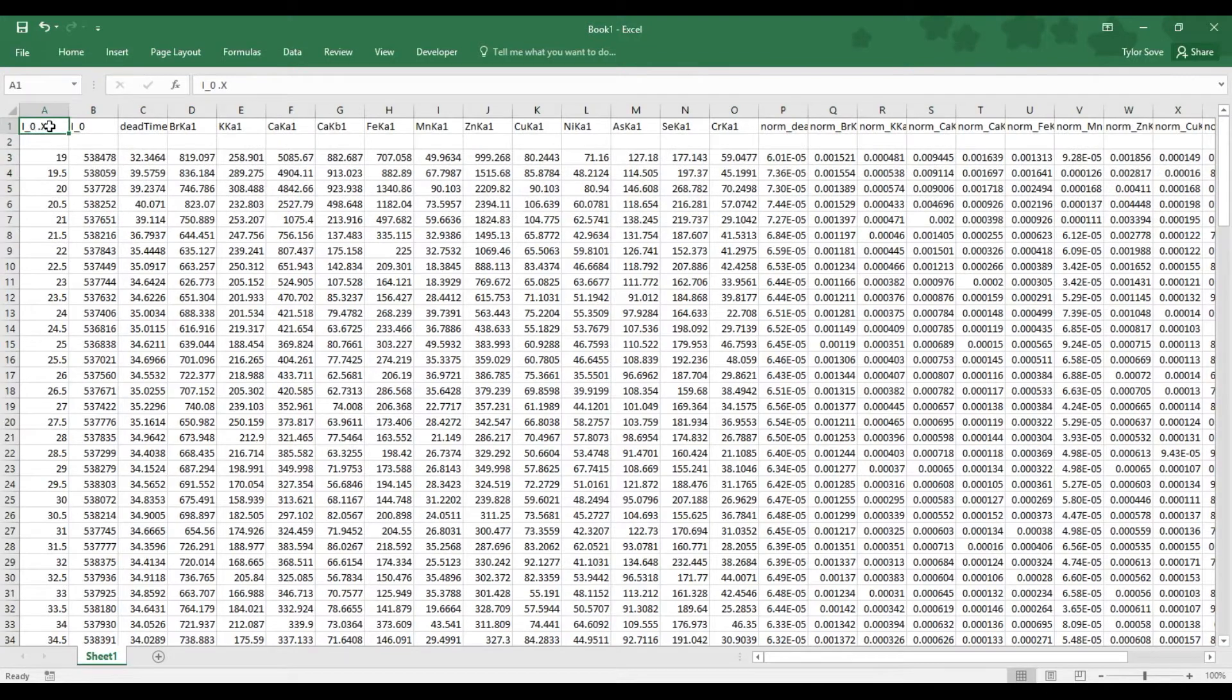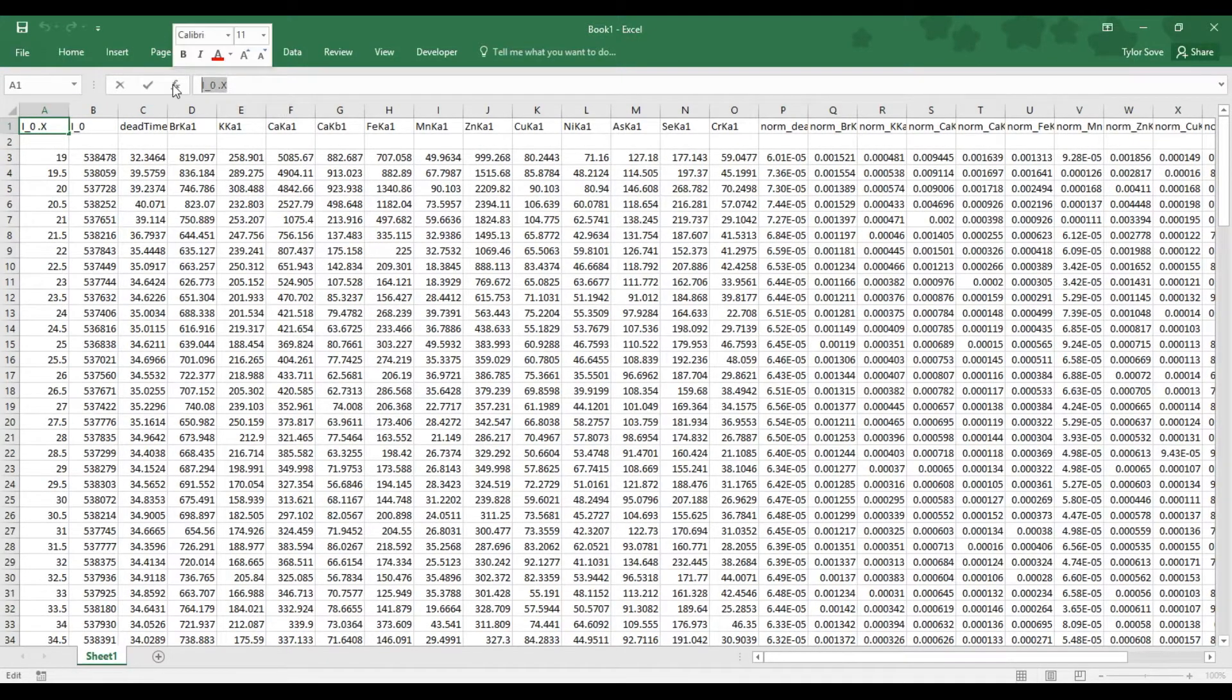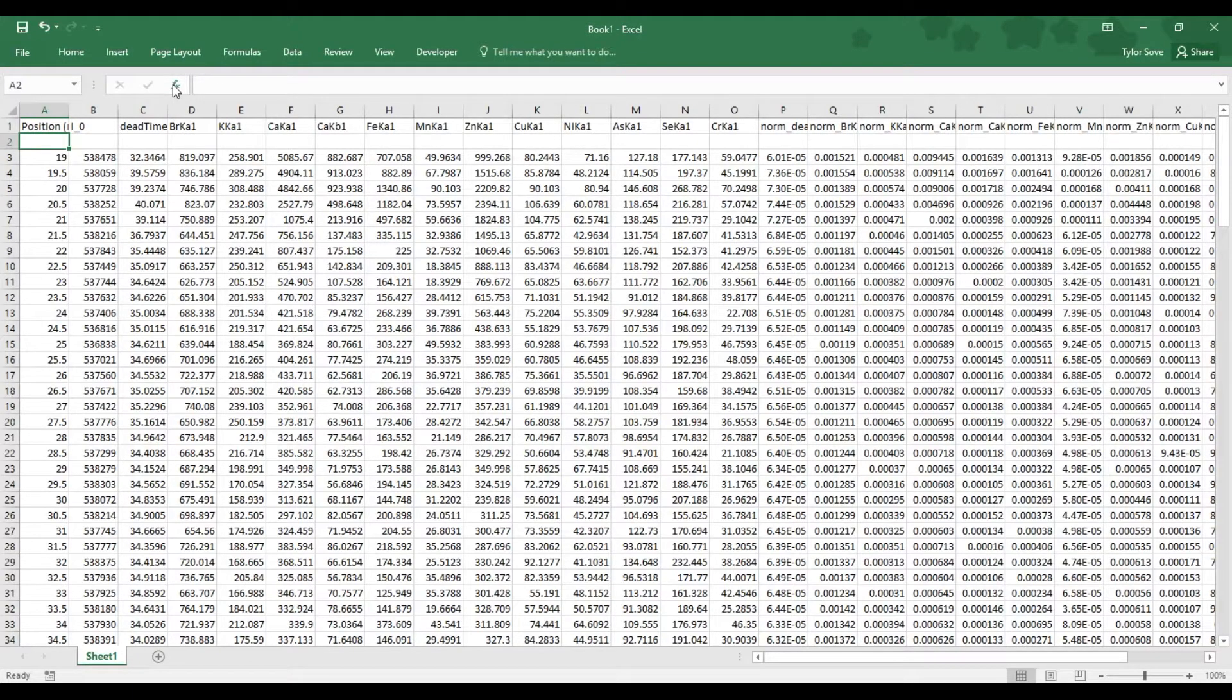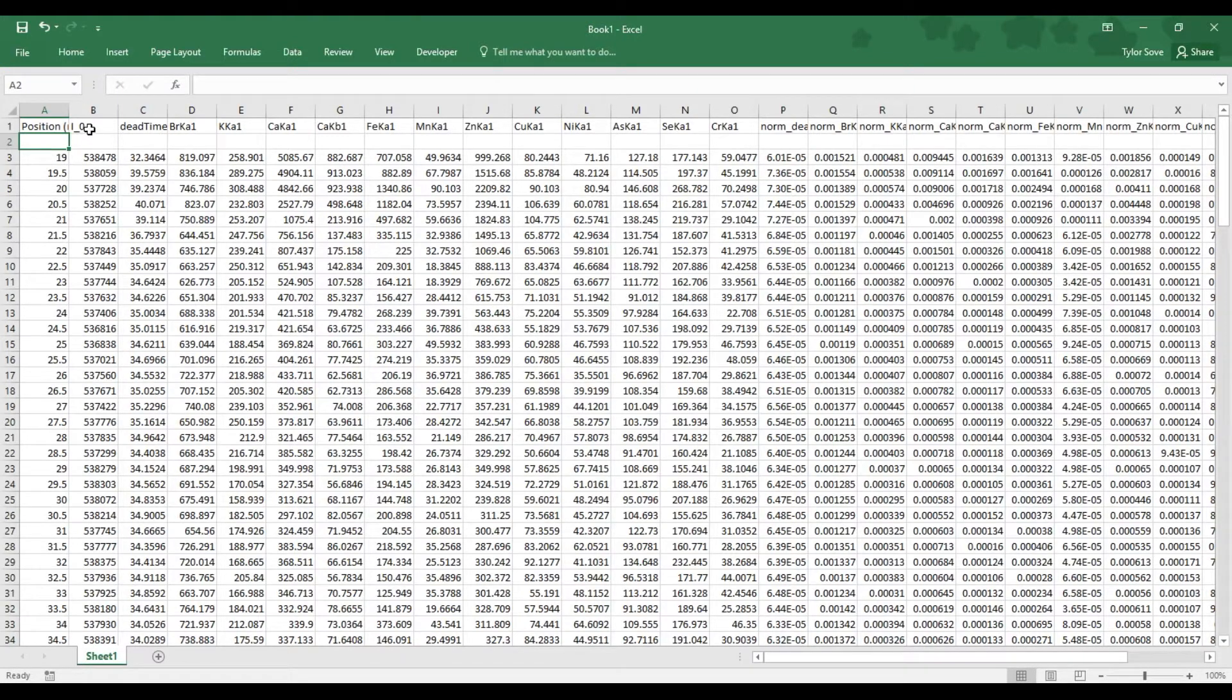What is now in cell A1 as denoted by I0X, relabel that to Position Millimeters. And that lets us know where on our sample the measurement was taken.